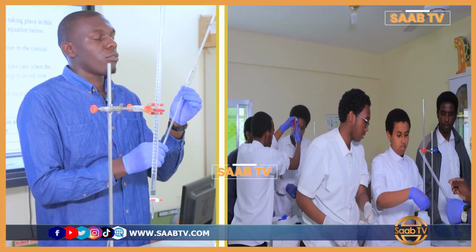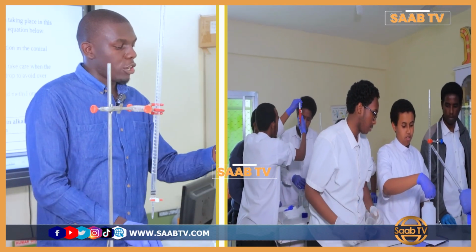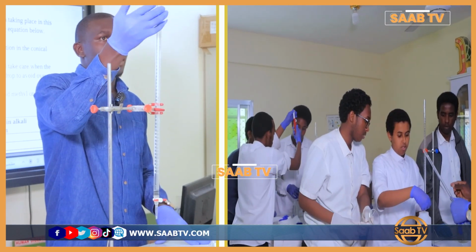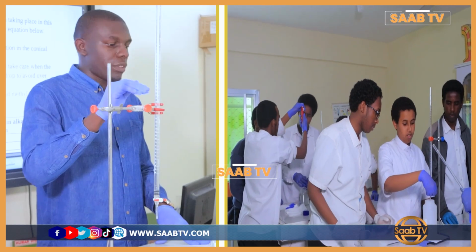Now how does this titration take place? The first step, we shall have to pipette 25 cubic centimeters of sodium hydroxide using a pipette. Then we shall put it in a conical flask. After that, we shall fill our burette with hydrochloric acid, up to the 0 mark. Then you record the initial reading of the burette.